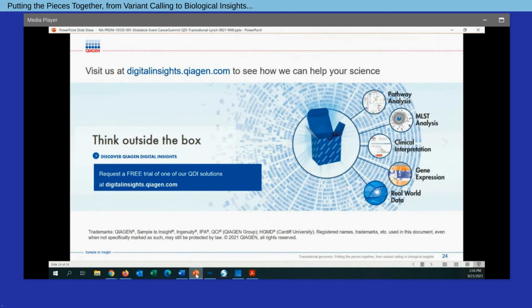Can we use it to check somatic variations for tumor samples without the normal reference? I have NGS sequence data available for only 40 tumor samples with no normal data. Yes. So in the Genomics Workbench, we have pre-built pipelines for workflows that can run in either of two contexts for somatic data. So to your scenario, if you are missing a matched normal, you can call variants, and perhaps you could employ a filtering step where you look at those variant alleles that are in dbSNP.